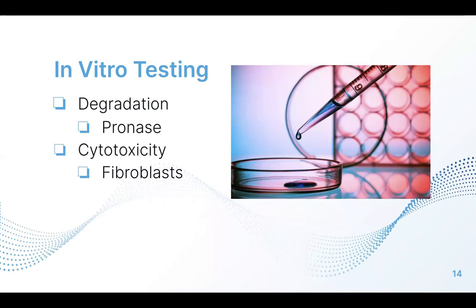For cytotoxicity, fibroblasts are typically used. So the scaffold will be left in a fibroblast solution for about 2 weeks and checked every few days, and it will be stained so that the live and dead cells can be differentiated.